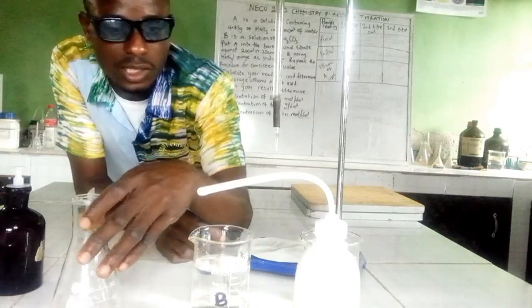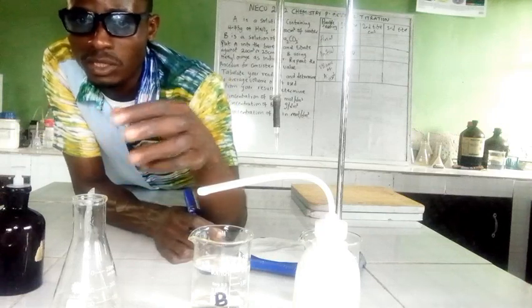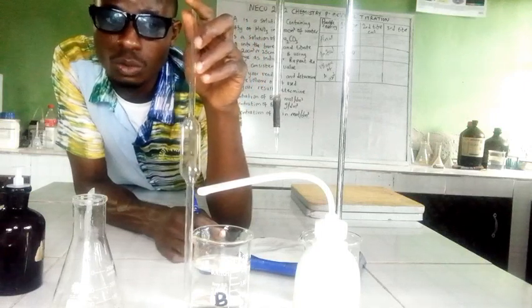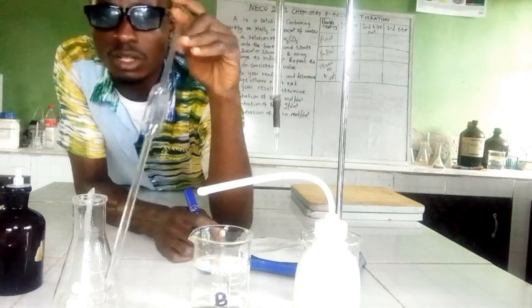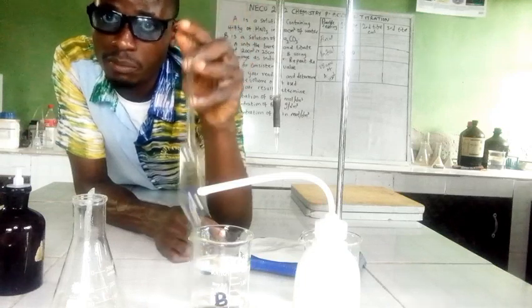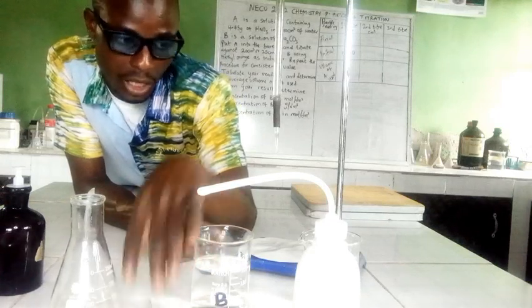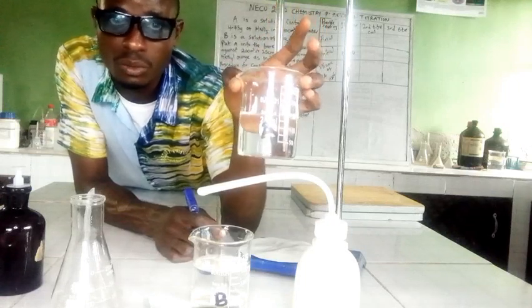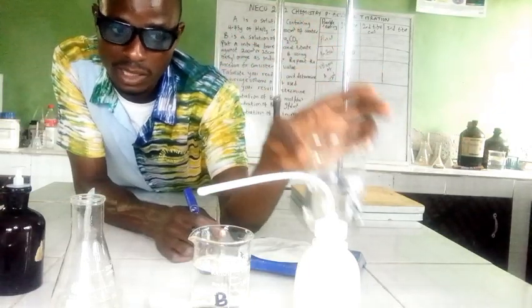So then you rinse the pipettes with the solution it is meant to contain, and that has been done already. So you rinse it with B so that it will not be diluted further by the time you use it in pipetting your B. So the B won't be diluted further. Then you use A to rinse the burette, because it's meant to be contained in the burette, for the same reason why we use B to rinse the pipette. And that has been done already.